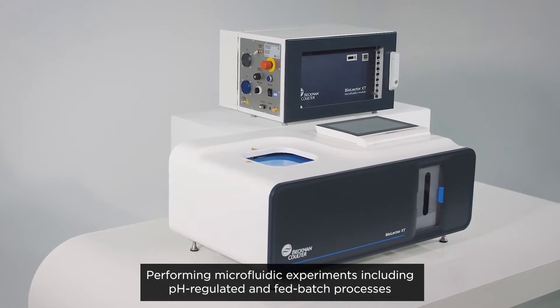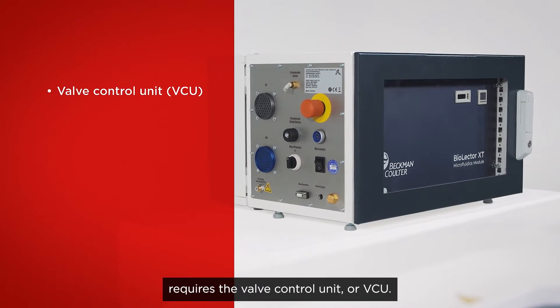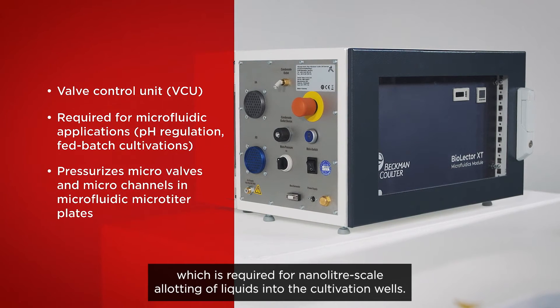Performing microfluidic experiments including pH regulated and fed batch processes requires the valve control unit or VCU. This additional device supplies the microbioreactor with compressed air, which is required for nanoliter scale allotting of liquids into the cultivation wells.